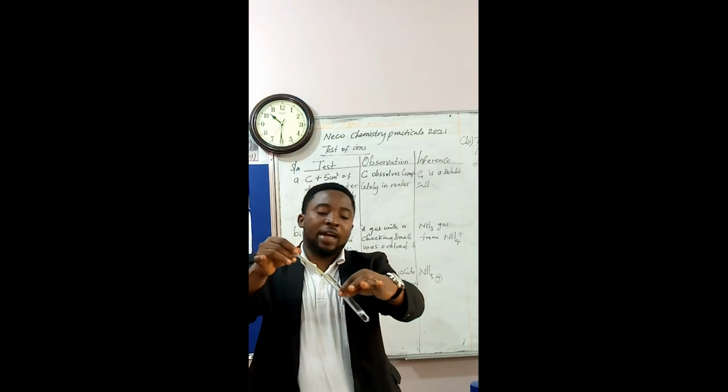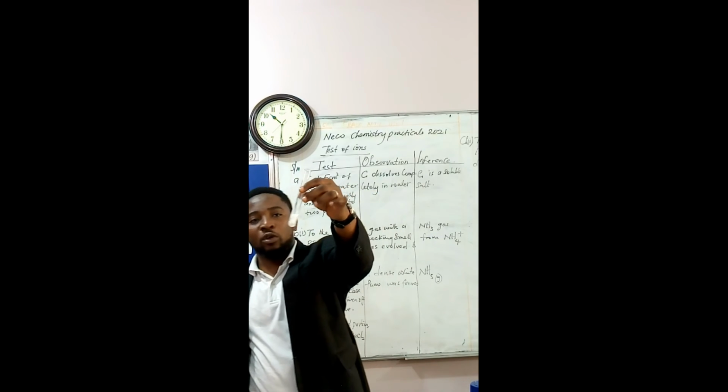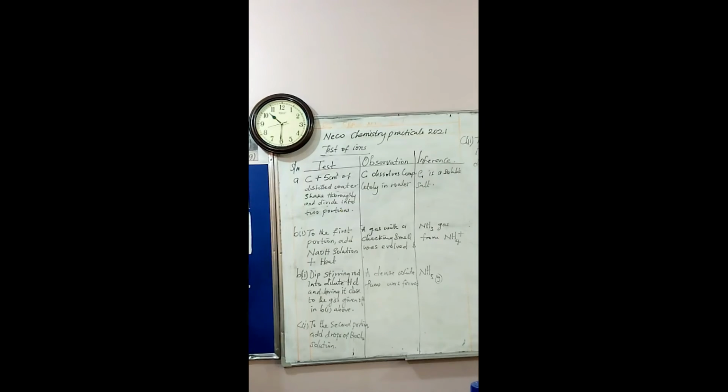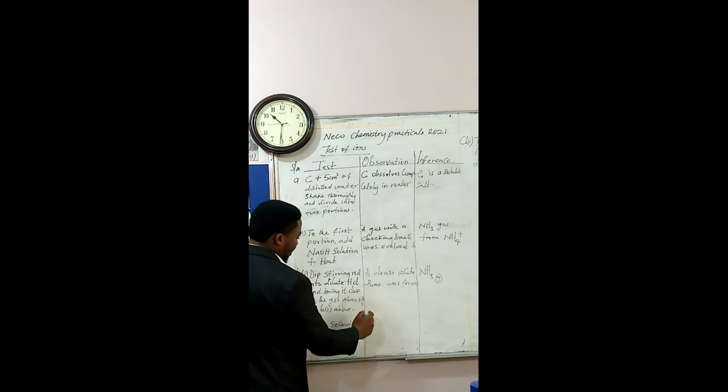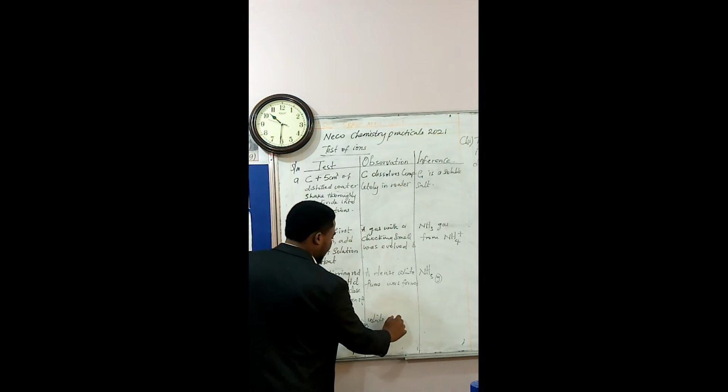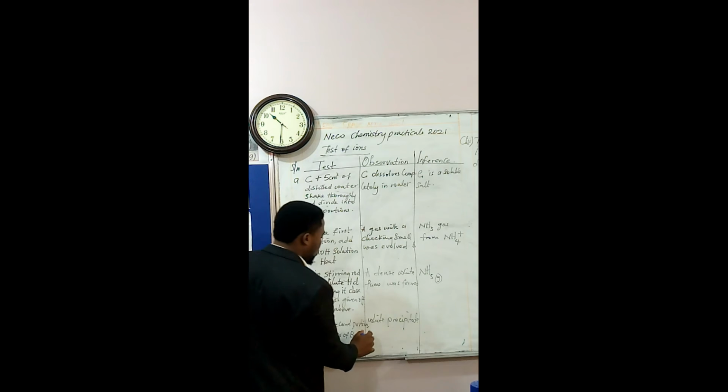You can see I have a white precipitate. So under observation, I'm going to write white precipitate formed.